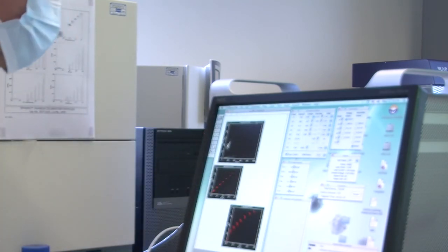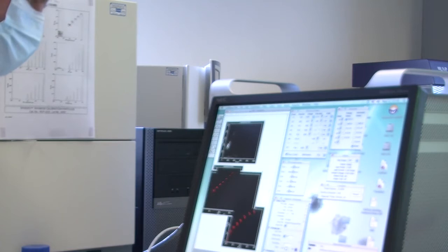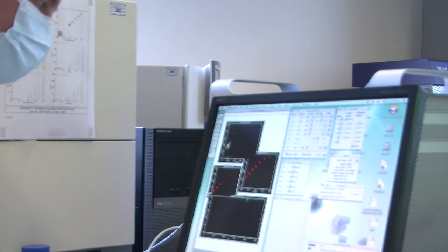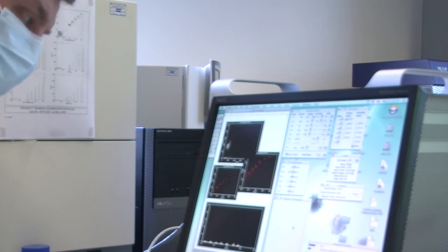Now, what we can also do, we can view it as a histogram, and I'll just draw one on top for the moment. I can always get rid of it. So these are QC beads. These are just there to check how well the instrument is running. But they're quite good for looking at this stage. If I do an FL1, and then we do a gate.